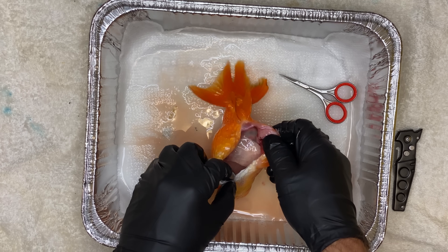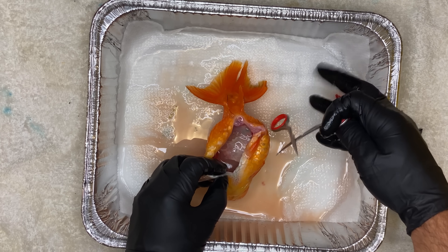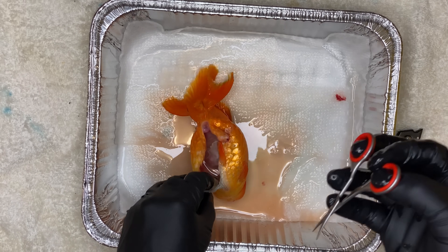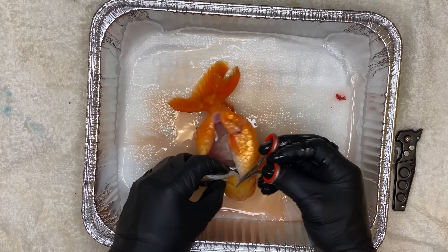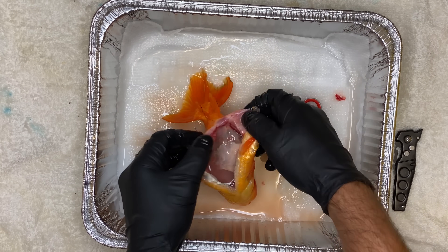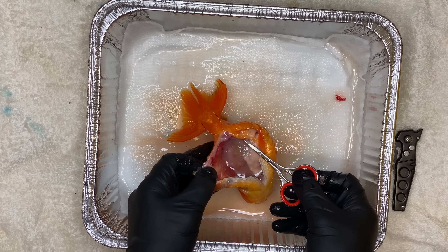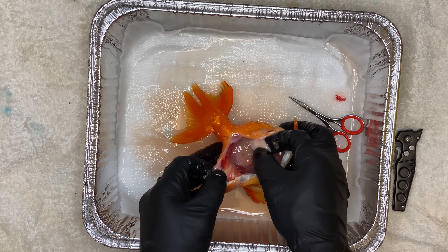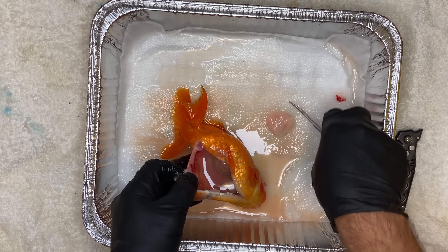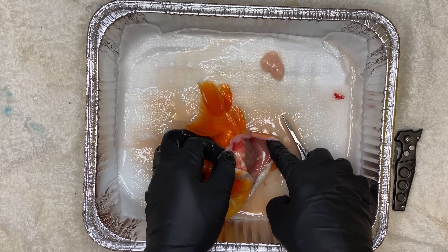Right here on top, you can see her reproductive organs, and they don't look as they should. They look basically like mush. It's right on top of her body cavity — this little piece of white, it looks like gristle. But this is basically what holds eggs, and it wasn't in the correct form. It was very mushy. There was nothing in there.